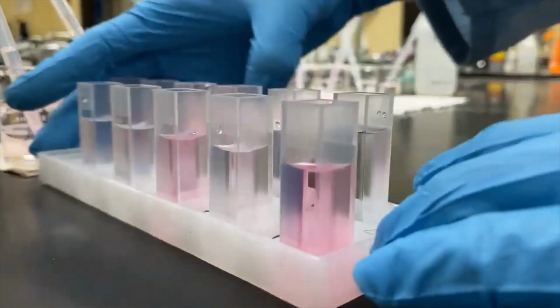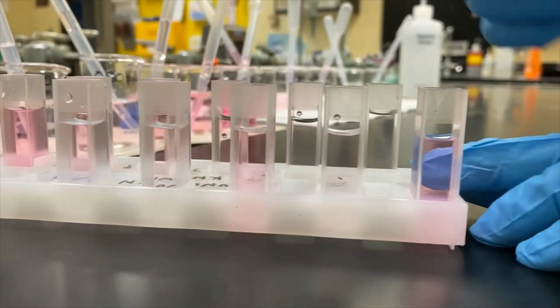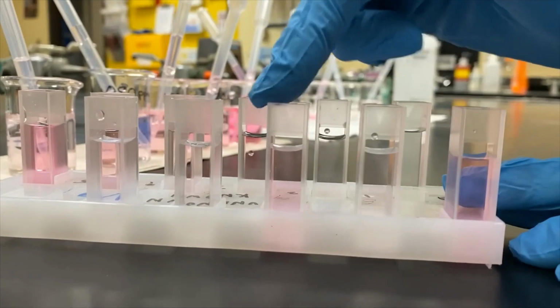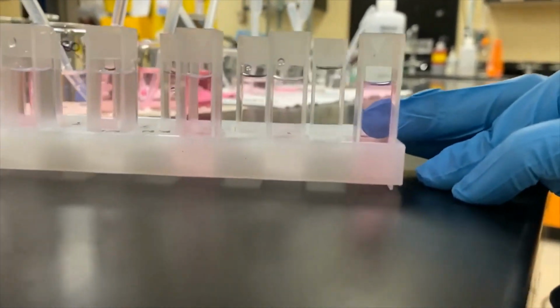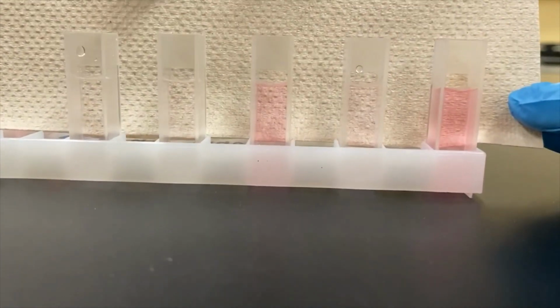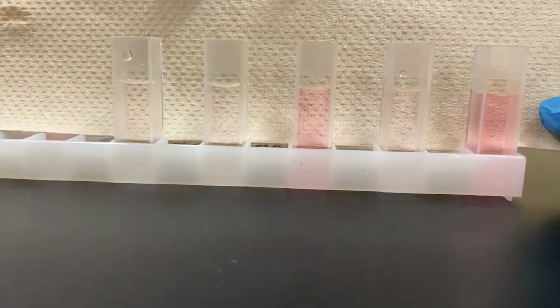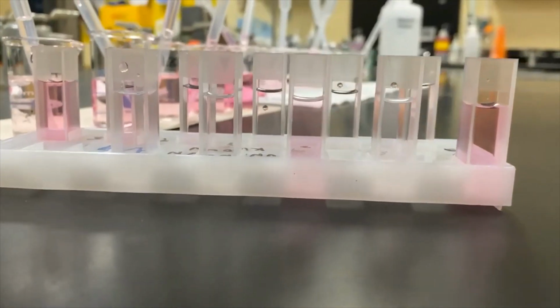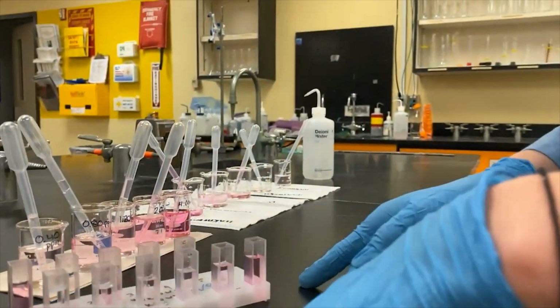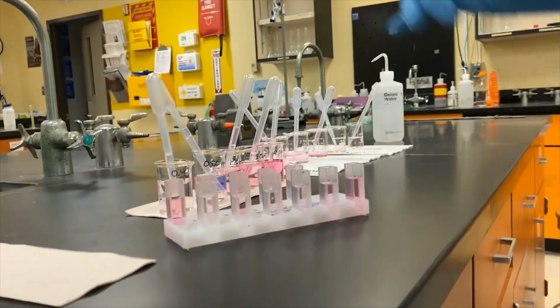And then if we turn around, we've got our unknowns here. So unknown 1, 2, 3, 4, and 5. And I'll give you a little bit of a background to help you distinguish between them. So next we'll take these over to the Red Tide optics and we'll show you how to actually process them.